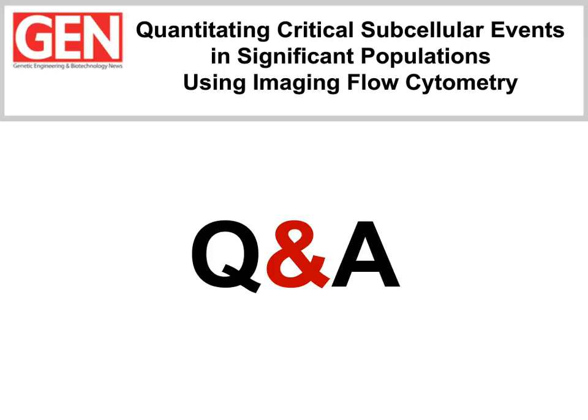Chris, question for you. Audience member would like to know, for foci identification from widefield images, did you use deconvolution or not? It would probably affect the numbers as well as magnification and stacking. Yeah, when we did the in situ work, we just used simple epifluorescence. We didn't have access to something like a confocal or a deconvolution capability. However, if you did do that, it might enhance the number of foci that you can actually see, and you'll probably see a lot more foci.